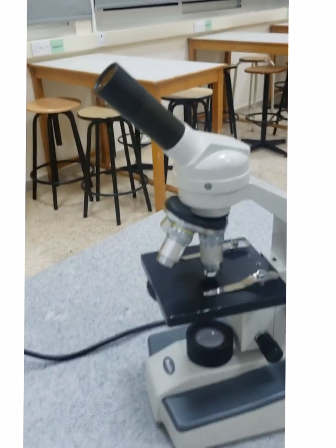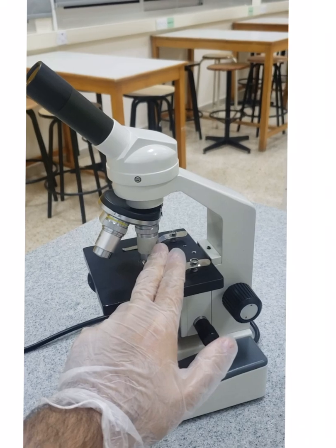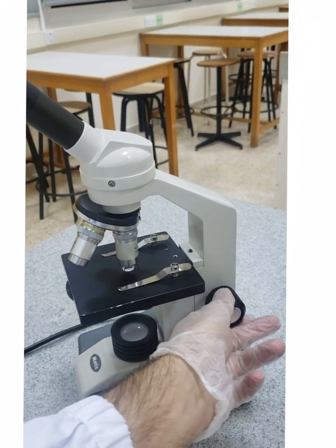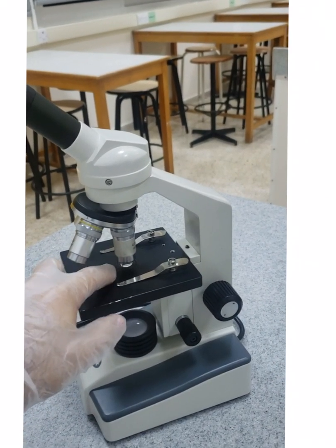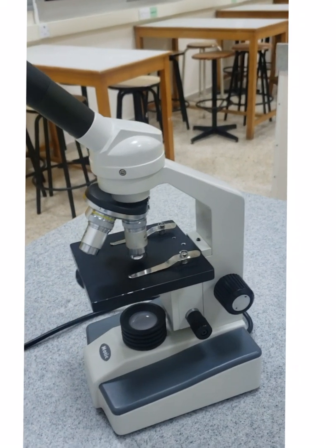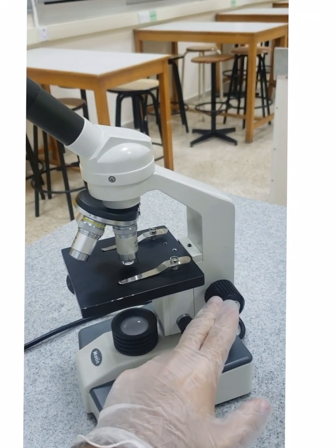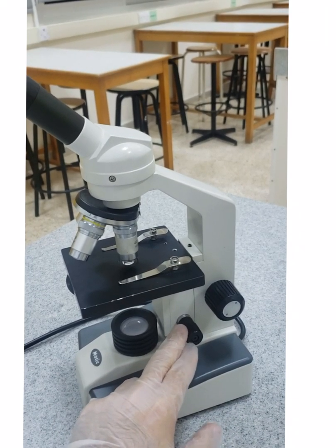40 times, I will use the fine adjustment in order to take the stage up and down and focus my picture. Don't use the coarse adjustment with the highest powered objective, otherwise you will take it in a very fast manner. You will break the slide and you will lose your specimen and you will break the microscope. So the coarse adjustment is for the least powered objective, the fine is for the highest powered objective.